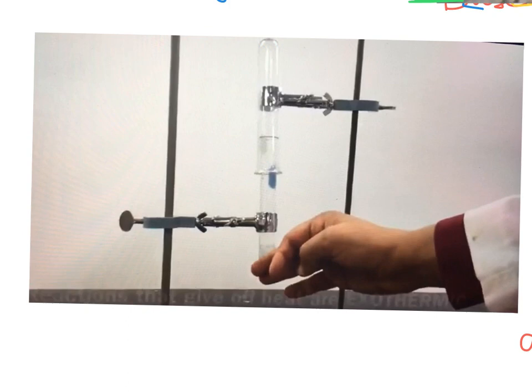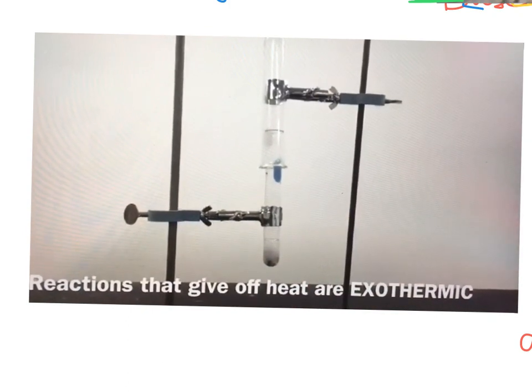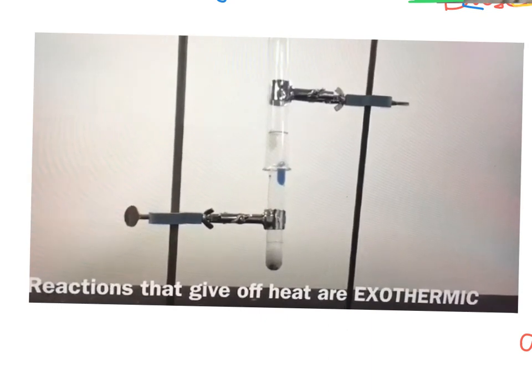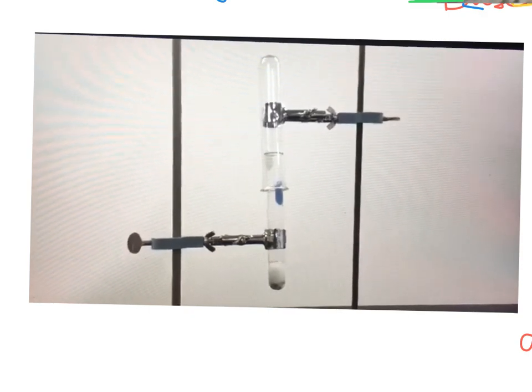Now we have to test the presence of hydrogen gas. As you touch this test tube, you will see that it is hot. As it gives off energy or heat, it is called an exothermic reaction. To check hydrogen gas, when you bring a burning matchstick near to it, it will burn with a pop sound.